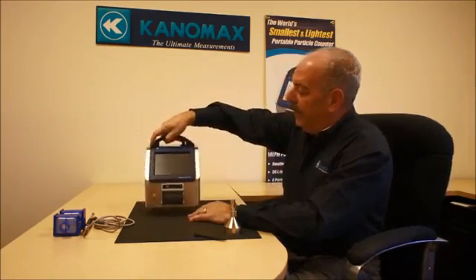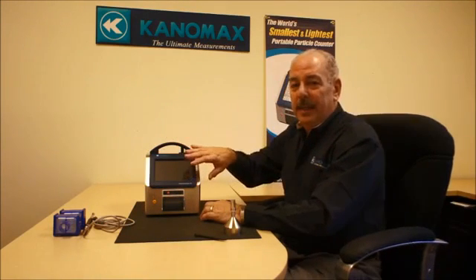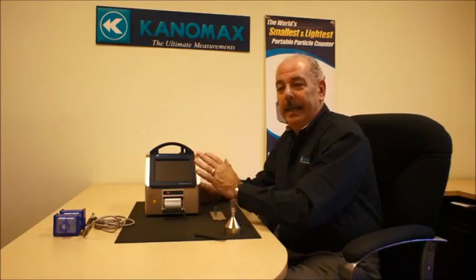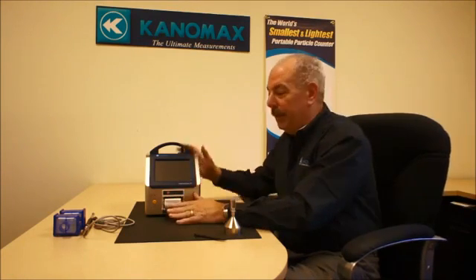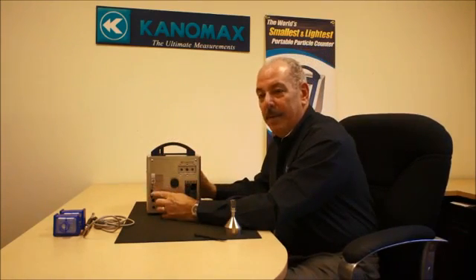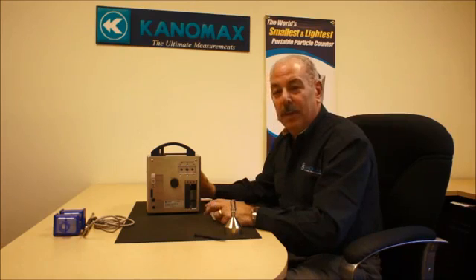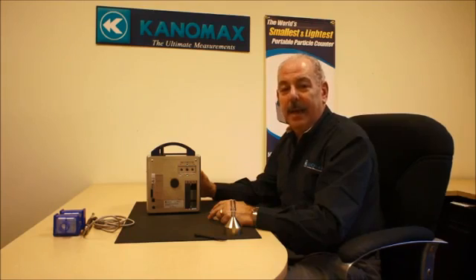The counter has a large 4.3-inch color touch screen and a built-in thermal printer. You can store data internally in the instrument as well as print it on the printer, with options for using an SD card memory slot as well as a USB flash drive. The unit can also be integrated into a LAN for remote operation, and you can access data that way as well.